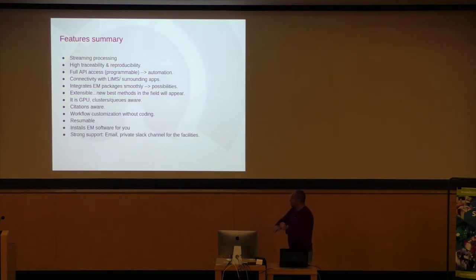I'm late. Okay. So in summary, we do have streaming processing. We think Scipion can trace and can help you to reproduce and repeat your workflow. There's a full API, and if you have some developer, even not Python, I think they can manage to integrate or interoperate with Scipion.